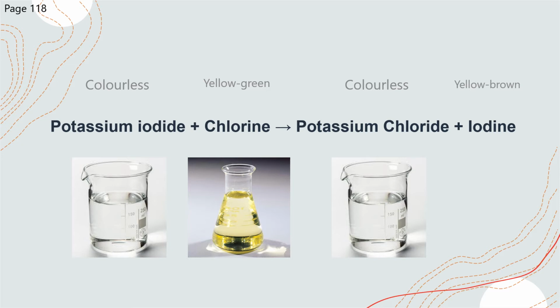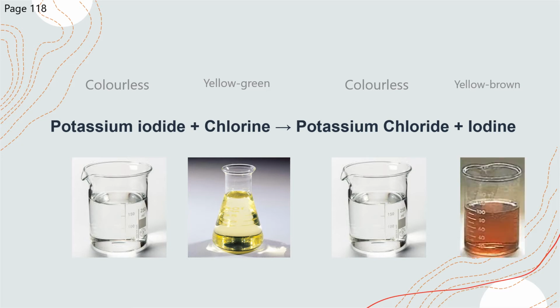So what we're really going to see quite easily is a colourless solution change to yellow-brown. Because again, the yellow-brown will control the colour in that beaker at the end. Okay, so it's as if you've taken a glass of water, you've added orange diluted juice to it, and suddenly it's changed to blackcurrant diluted juice. So your beaker's not colourless, your beaker's not orange, it actually is that red colour of the blackcurrant because displacement has taken place.